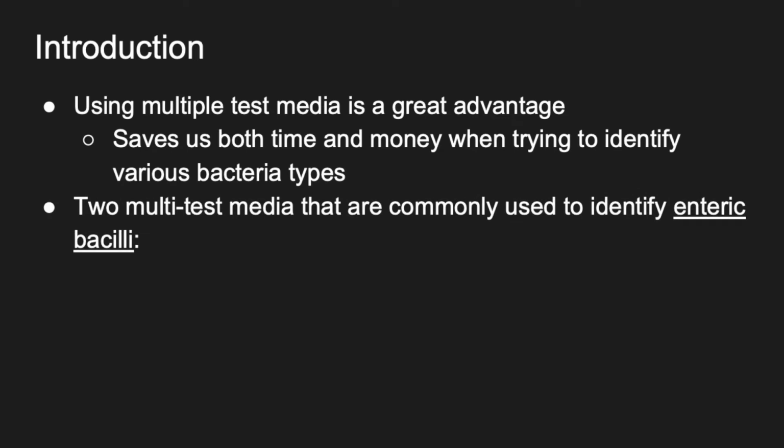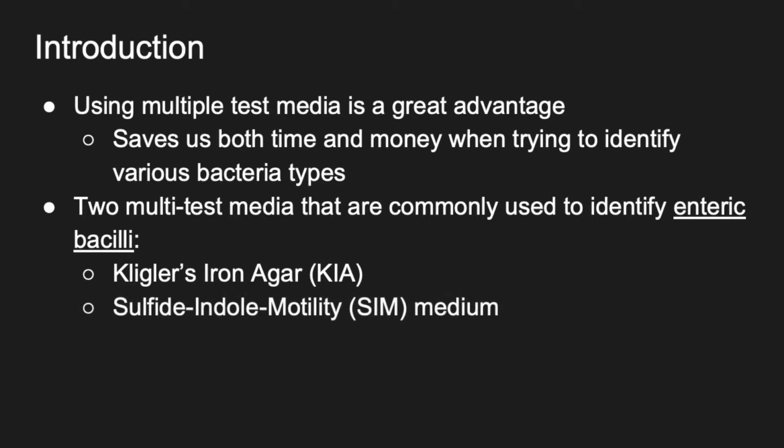Two multi-test media that are commonly used in the lab to identify enteric bacilli that we would have been doing include Kligler's iron agar, or KIA, and sulfide indole motility medium, or the SIM test, or the SIM medium.